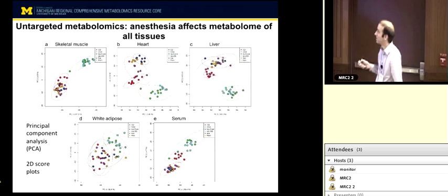And so what metabolites are responsible for these differences? What's driving these differences? So we looked at the results from our untargeted metabolomics, and we ranked our metabolites based on the order of importance in driving those differences. That's something you can do either using partial least squares discriminant analysis, or using another method of statistically ranking your features. And these are the sort of features we pull out. And so the metabolites that were different from condition to condition were different between tissues, although we see some things that are somewhat the same.